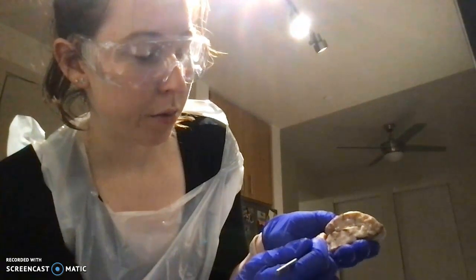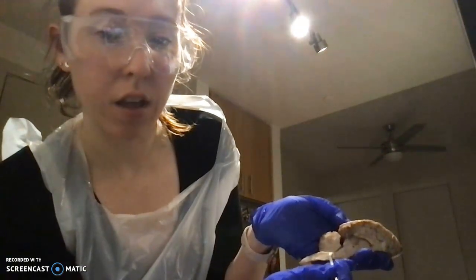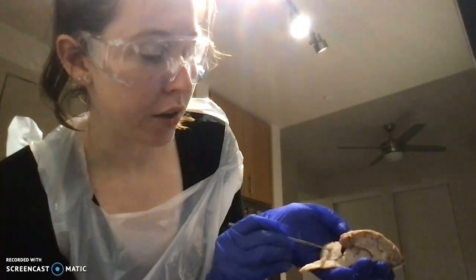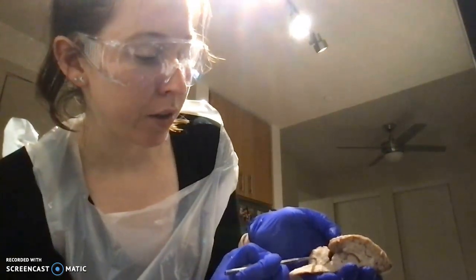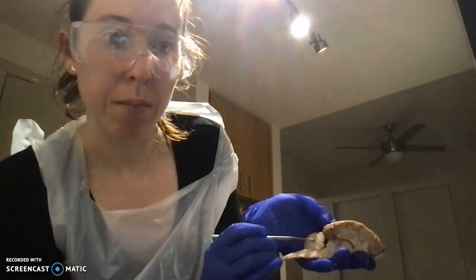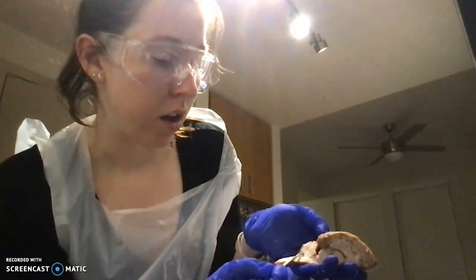As we head down here, we have this area called the midbrain. And then right here is the medulla oblongata. And across from the medulla oblongata, we have this big structure called the cerebellum. Inside the cerebellum, there is this branching white structure. It's called the arbor vitae, but the white part that makes up the arbor vitae is also called the white matter.